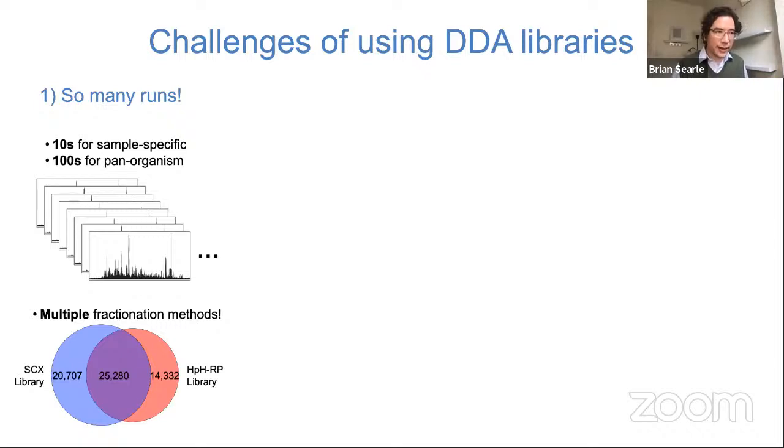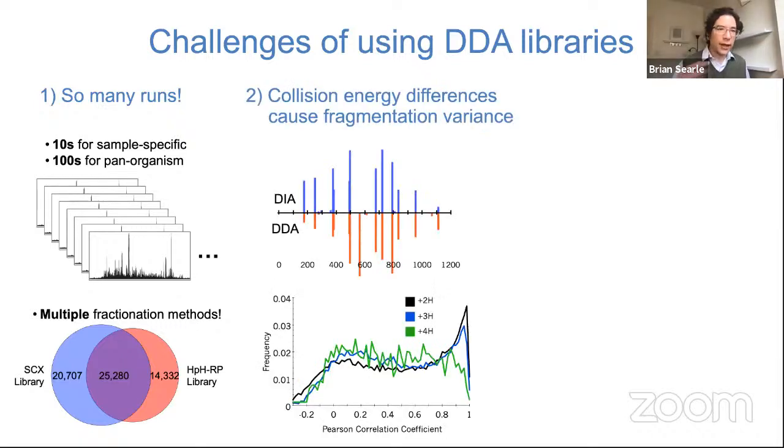So in those particular cases, because those different types of peptides identify different blocks, you actually kind of need to use multiple types of fractionation methods to build those peptides. The other aspect of this is that collision energy optimizations are actually a little bit off.